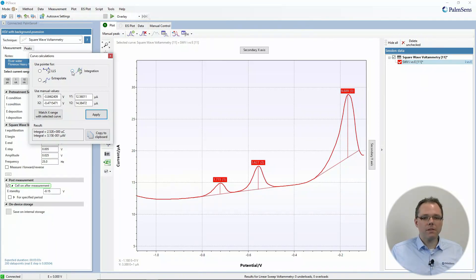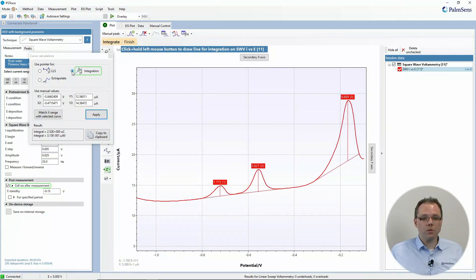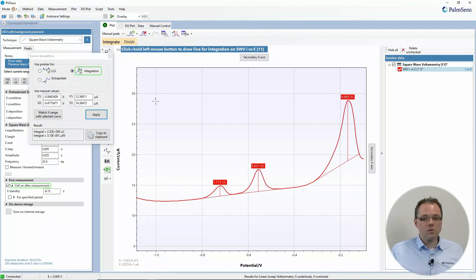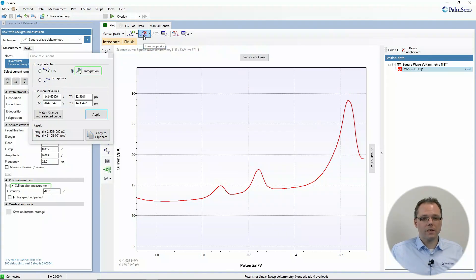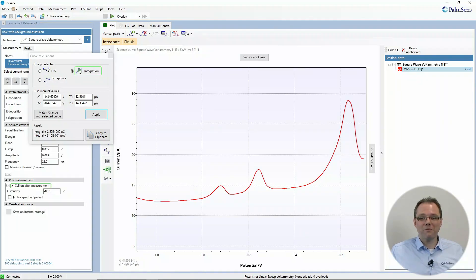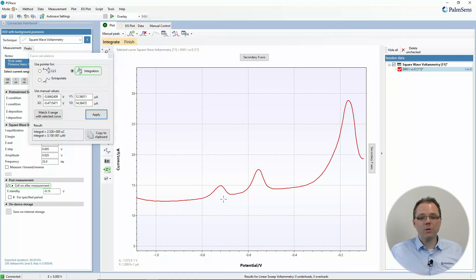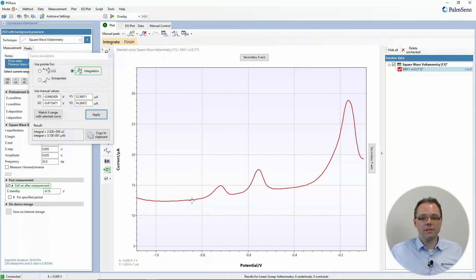So let's start with integration. You just choose the option to do integration and then the software already tells you what to do. Let's first remove these peaks so we can see the curve a bit better. And let's say for some reason these two peaks are actually the species I'm interested in.